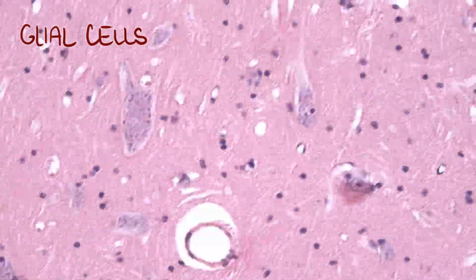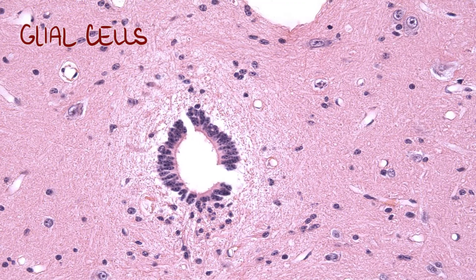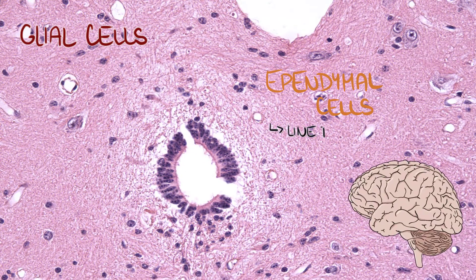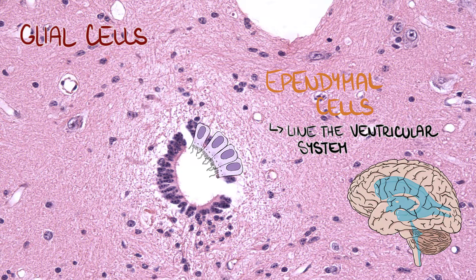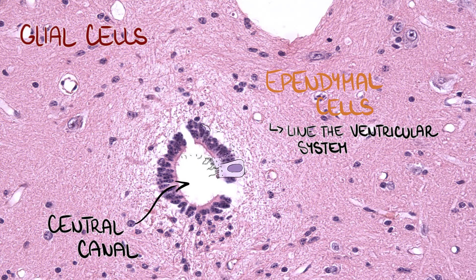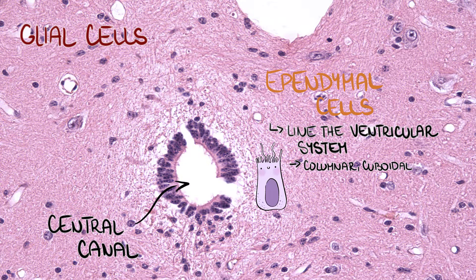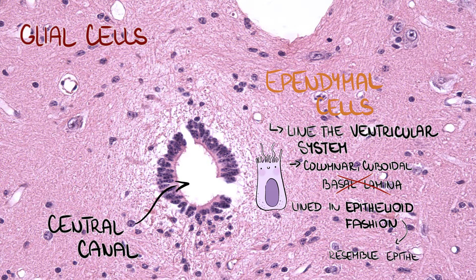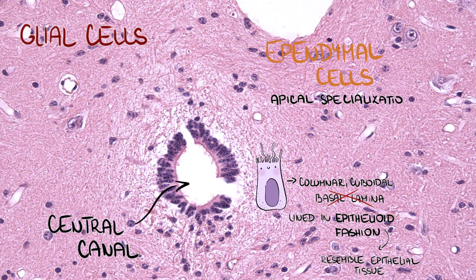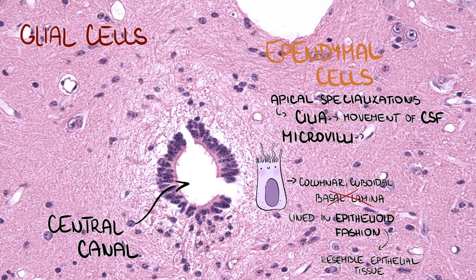The last type of glial cells found in the central nervous system are ependymal cells. These cells line the ventricular system, and we can find them in the region of the central canal in the spinal cord. They look like epithelial cells — they are columnar or cuboidal — but they lack a basal lamina, so we say they are lined in epithelioid fashion. They have apical specializations like cilia, which facilitate the movement of cerebrospinal fluid, and long microvilli, which help in absorption. They are also involved in formation of the fluid.